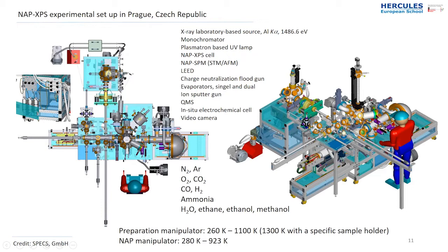This X-ray source has in this part a monochromator that makes the data better resolved, with a better signal. We have a charge neutralization flood gun because sometimes your sample is not conductive, and it might be the same problem as you might meet during observation by scanning electron microscope, when you have charging of electrons on the surface that makes the image unclear, blurred, and unfocused.